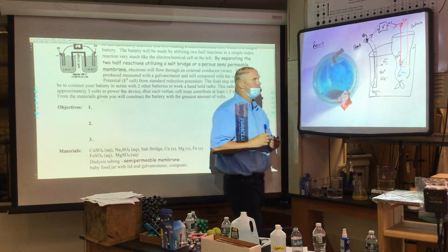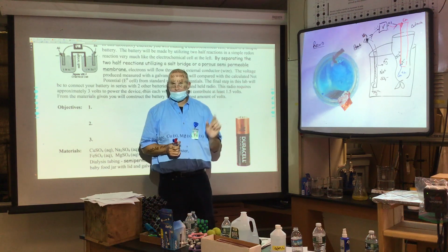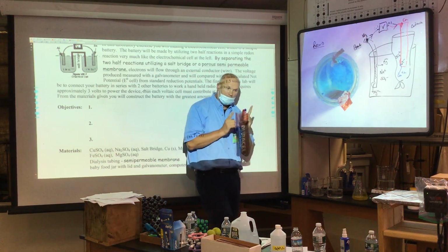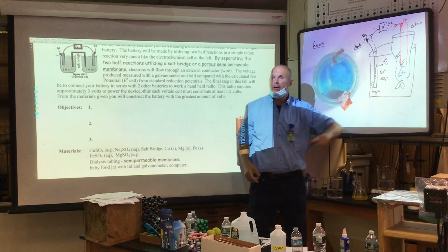Everything we've covered so far. However, if we don't describe the salt bridge, there'll be 0 voltage here. And of course, there's a salt bridge. There has to be a place that allows ions to flow, and that was the porous what? The porous bag made of cellulose.